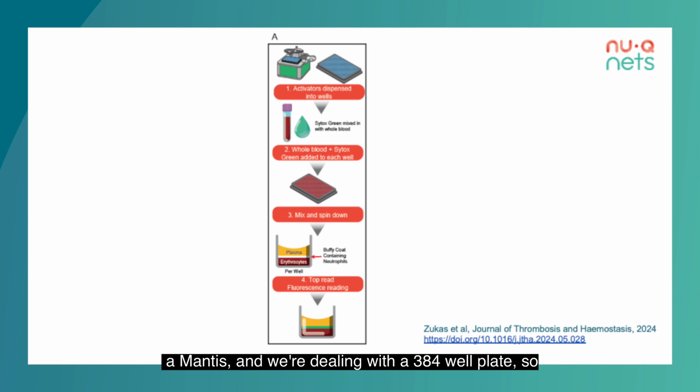And I tip my cap to the innovation lab here, to all the work that was put in to standardize this process, make sure it was controlled and make sure it was really reproducible. And so in the first part, we're just showing again concentrations of PMA leading to NET release, but it was reproducible and they could do it in a coherent, cohesive, reproducible, consistent fashion. Now, what did we do next?